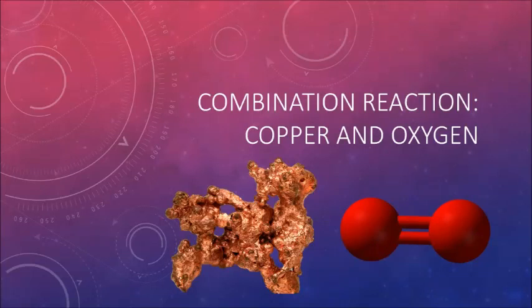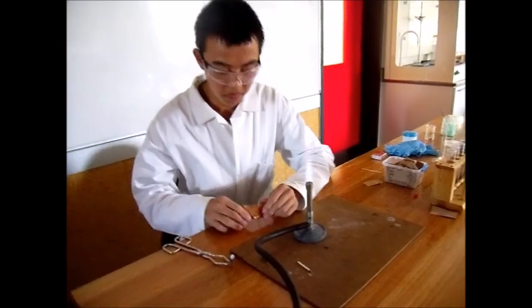The combination reaction between copper and oxygen. Well, this is a folded piece of copper, also known as a copper envelope.